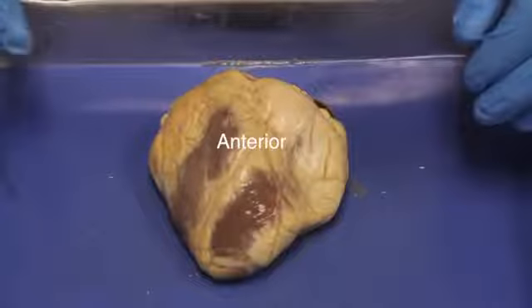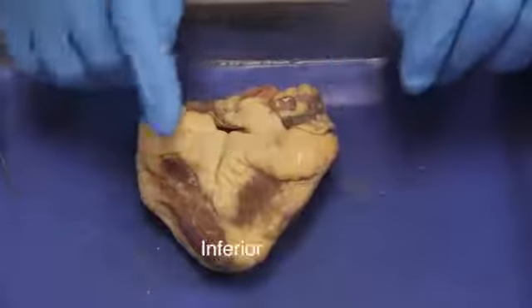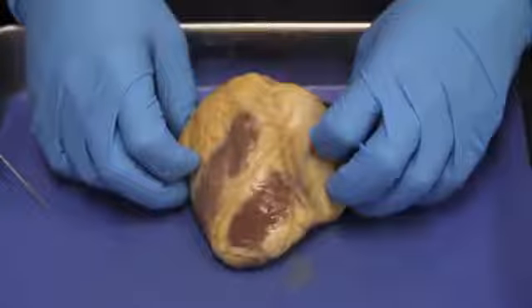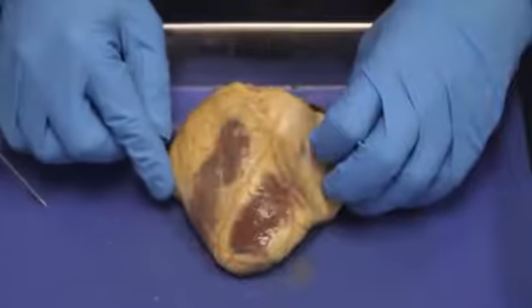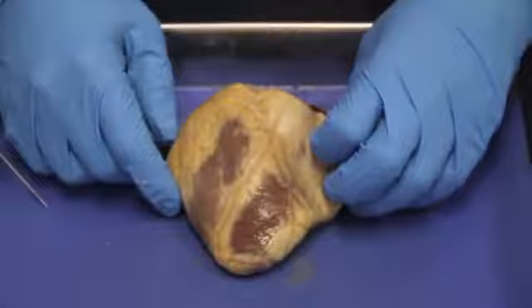We've correctly oriented our heart. We know anterior, posterior, inferior, and superior.